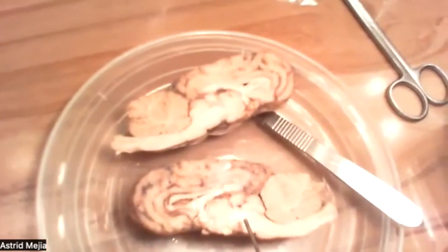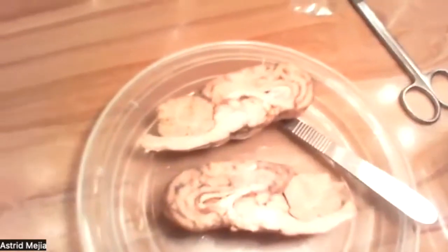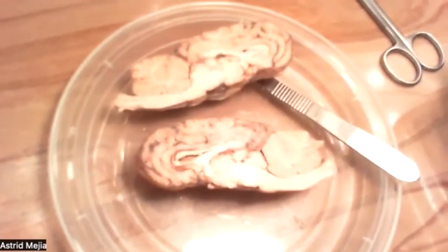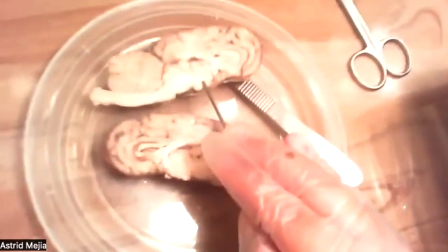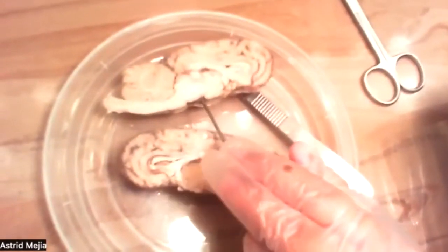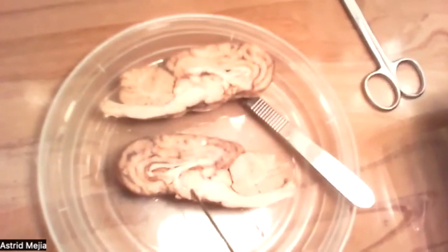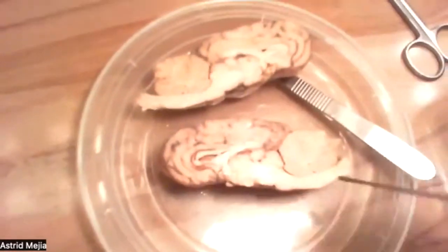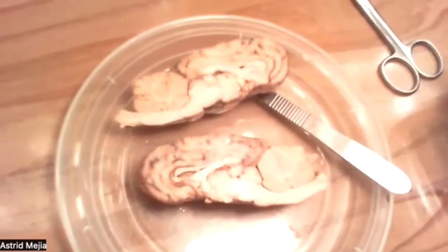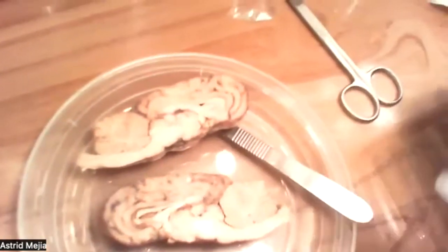Okay, and then we're going to be able to see the hypothalamus, which is right here. The hypothalamus would be this part right here, and then this part right here. The hypothalamus produces hormones that control body temperature, heart rate, hunger, and mood.